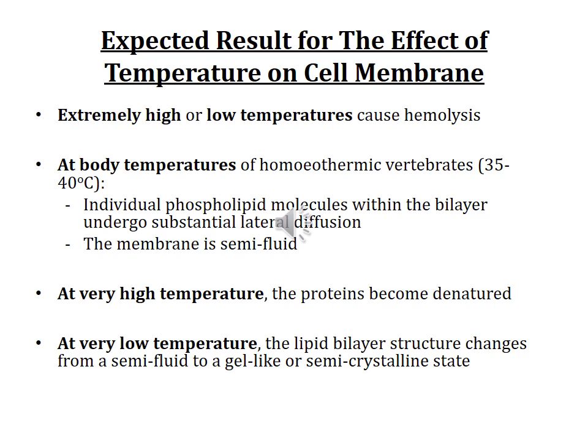At very low temperatures, such as minus 80, when water freezes, it actually expands. And by expanding, it pushes against the cell membrane, and this causes it to rupture or break. So we also expect hemolysis to occur here. At body temperature, which is the perfect temperature for the red blood cells, we expect no hemolysis, of course. So in question 1A, it asks, based on your findings above, are your results as expected? This is slide 23. So this is what we expect.